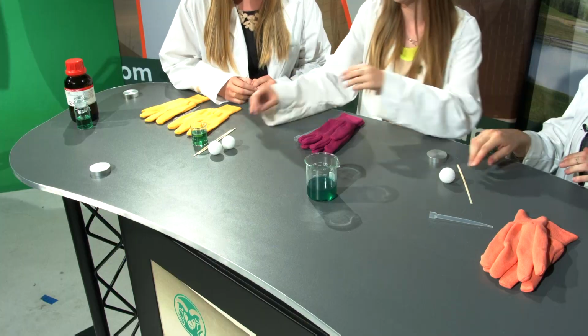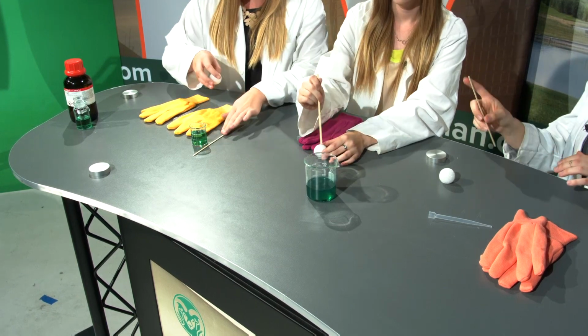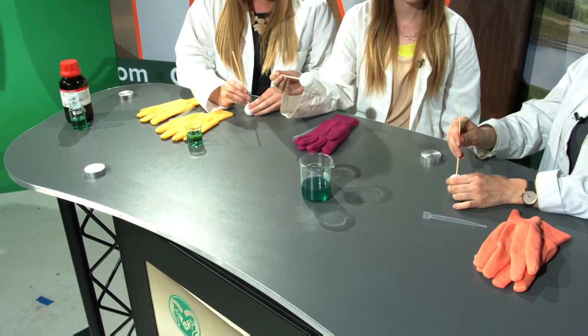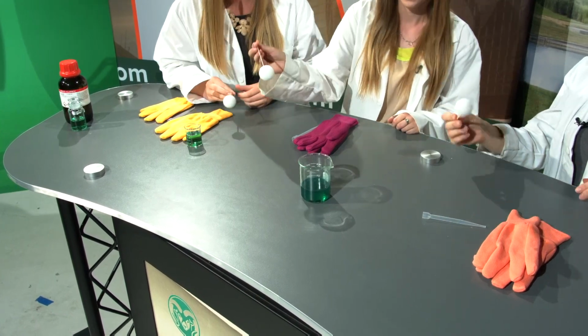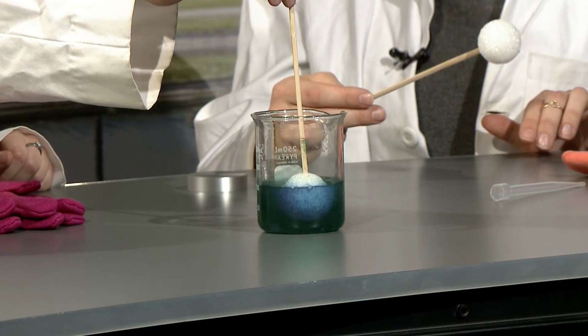Cool. Awesome. So should we get started on the witch melting? Witch melting, yeah. Yes, so we were going to let you do it if you want to. All right, sounds good. Would you like one of us to demonstrate it first? Yes, please. Okay. So what you're going to do for safety, take this stick and put it in the ball, if it'll go. Got it. And then you just dunk it in here, and it starts to melt.